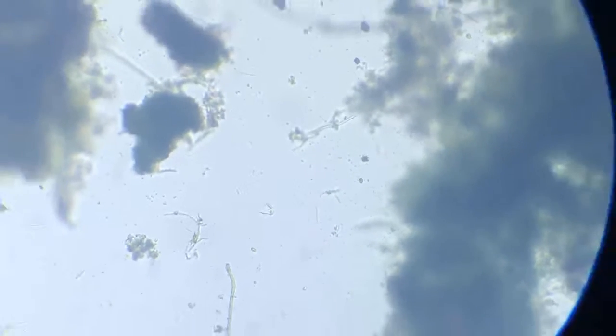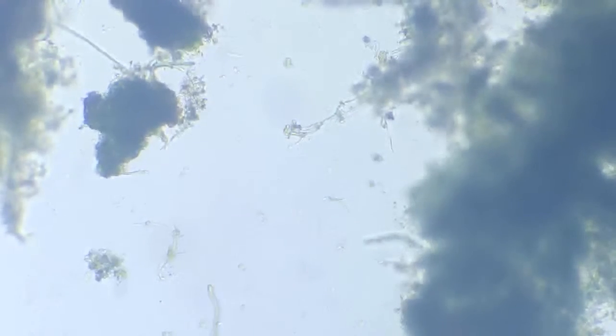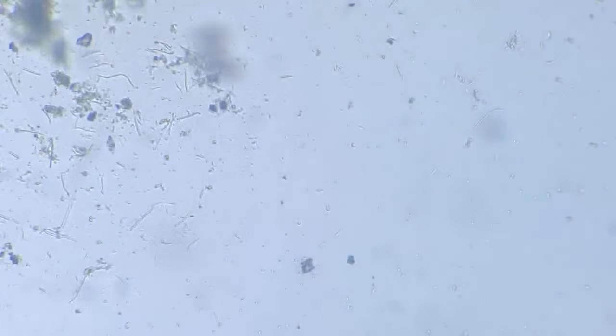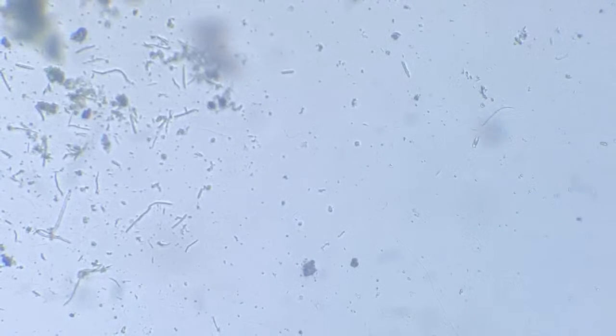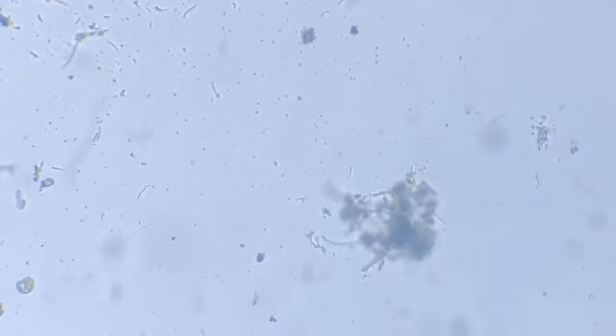So I'll scan from the lens. Nothing visible, nothing visible, nothing visible.